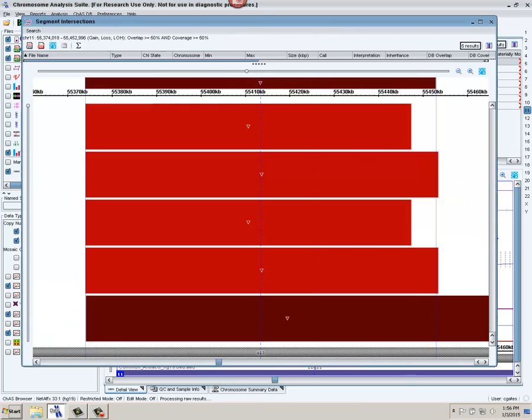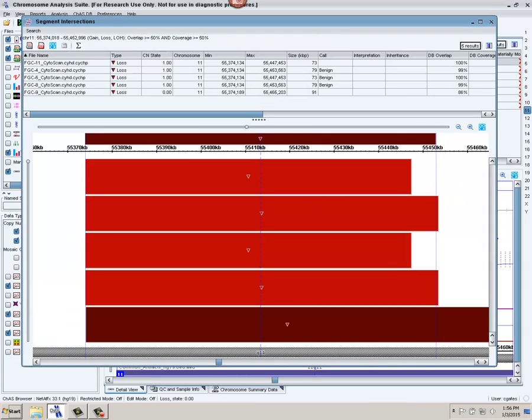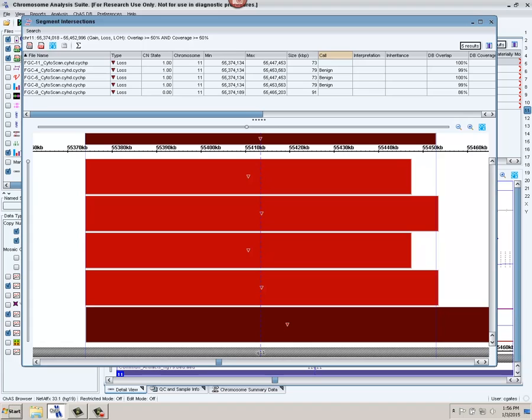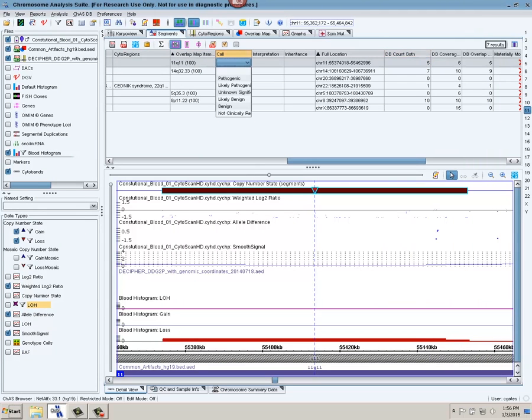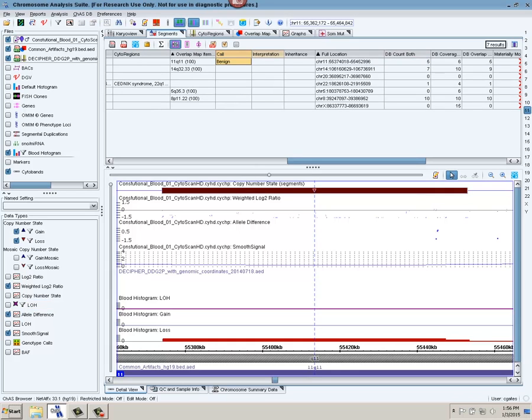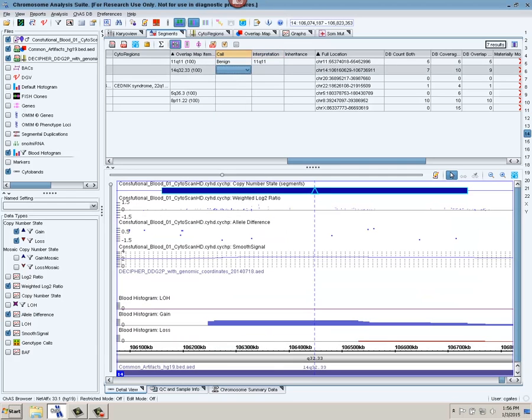So I do know from my overlap map that this region of 11Q11 is known to be artifactual. But I can go ahead and check my database by right-clicking and choosing Query ChasDB, bringing up my segment intersections to see my current segment here. What does it intersect with in my database? And as I can see, the breakpoints are pretty consistent, the blue lines, the vertical blue lines. And all the calls are benign in this case, or three of the five calls that I have interpreted previously. So since this overlaps with my overlap map, I'm feeling pretty good. I can call that benign. And then add an interpretation of 11Q11.